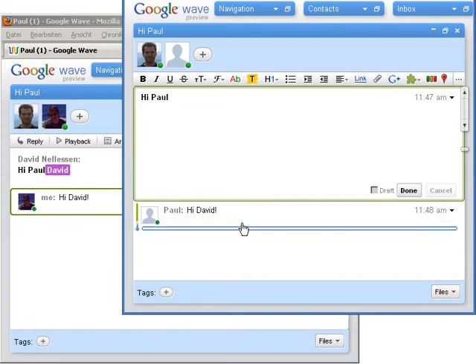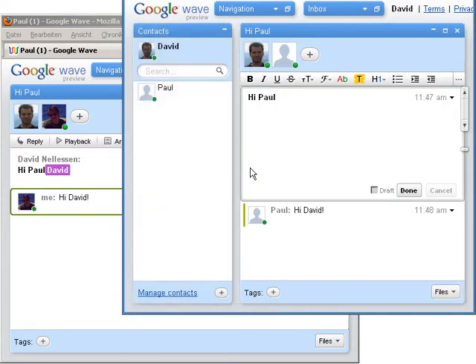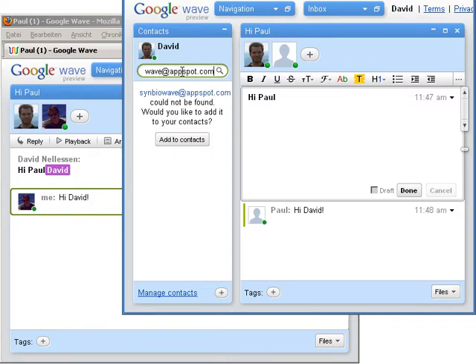So what we do is, first of all, add the SynBioWave robot to our contacts list. Okay.